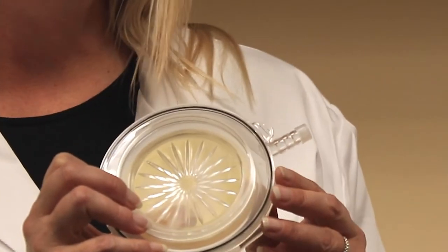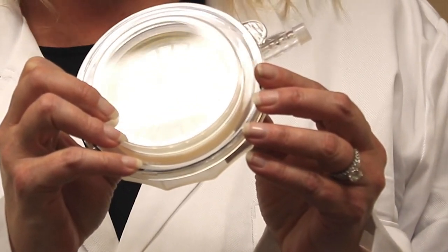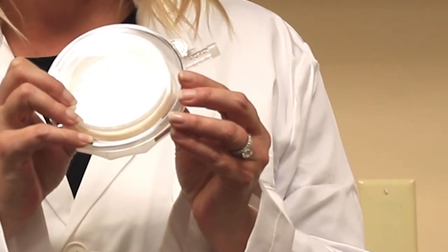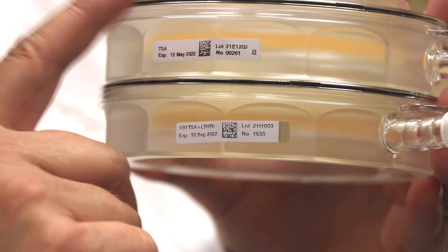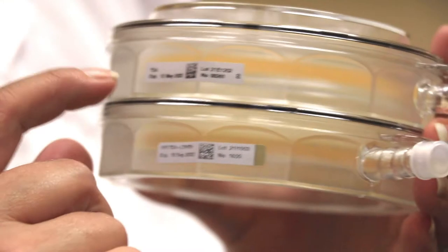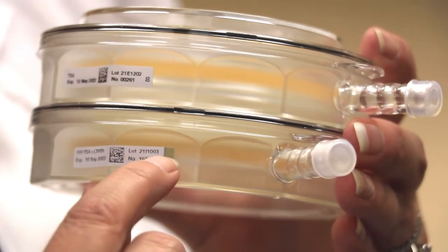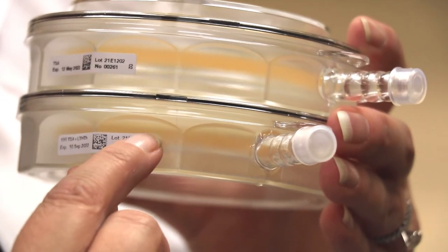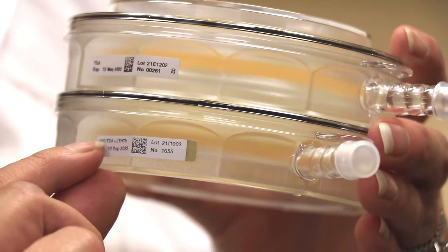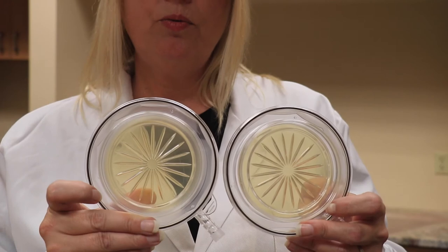I'm going to point out some of the differences. If you purchase both the 25/50 and 100 liter per minute and you want to make sure they don't get mixed up, there are a couple of differences you can tell. If you see both plates together, the top plate is the 25/50 liter per minute. Here's the label, and this is the label for the 100 liter per minute — you'll see a gold stripe here. This gold stripe indicates it is 100 liter per minute. You'll also see a label that tells you it's 100 liter per minute.